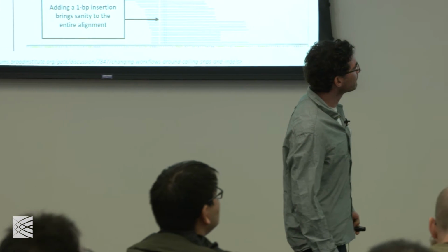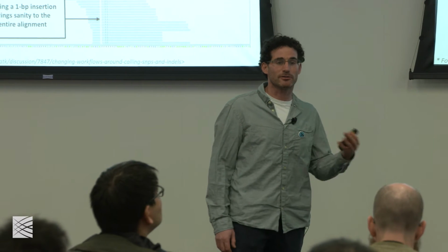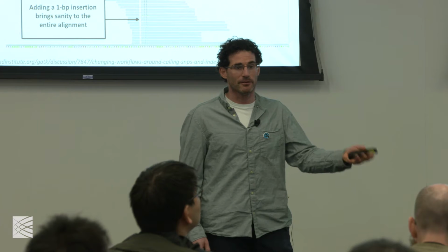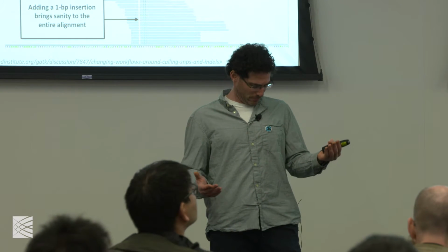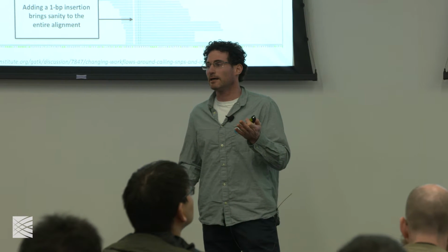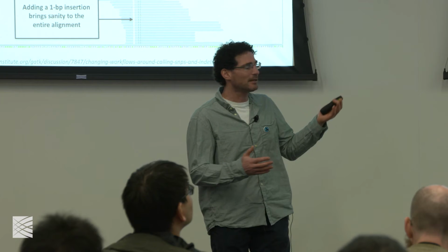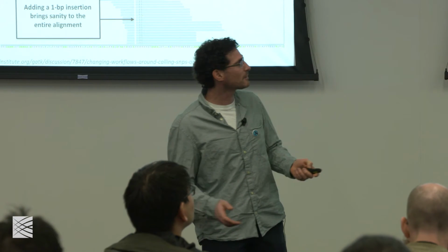Right. So as it says here, this is not necessary when using assembly-based variant callers like Mutect and HaplotypeCaller. For RNA, you don't really care about the specific alignments. Usually you just look at your counting expressions, so it's not such a big deal.